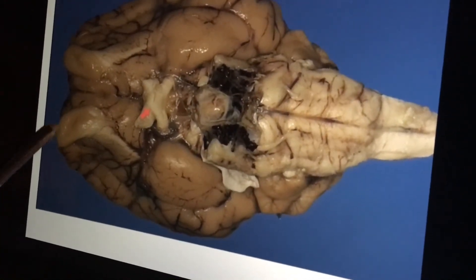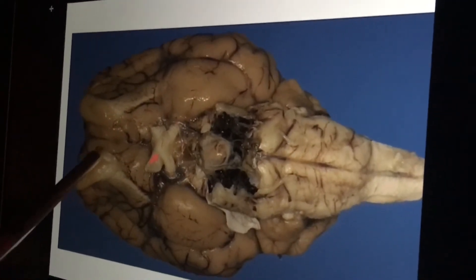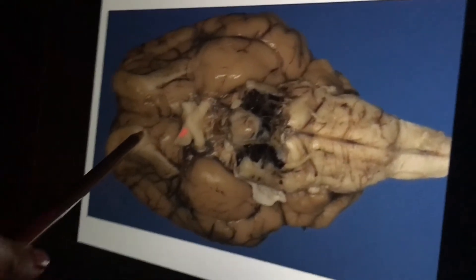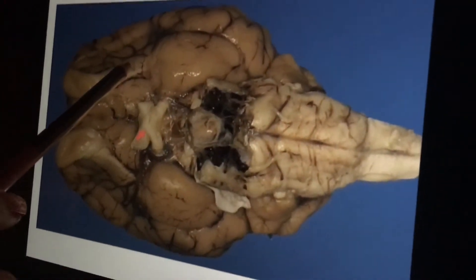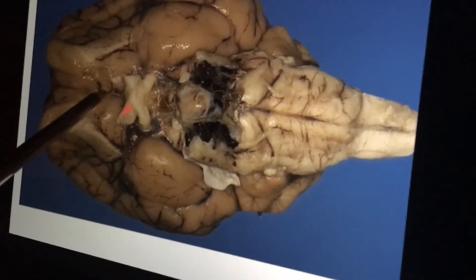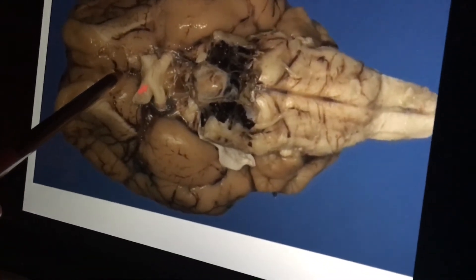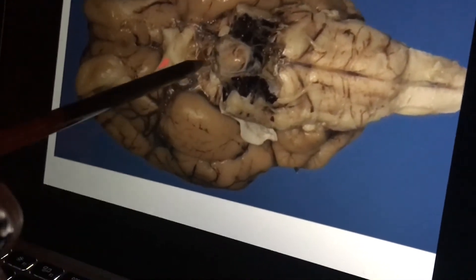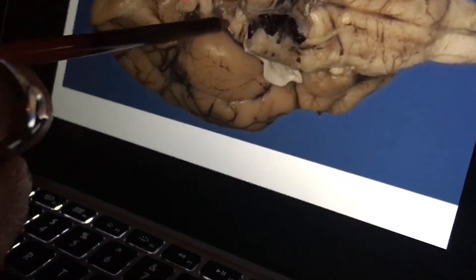Here are the olfactory bulbs, olfactory tracts, the oculomotor nerve, and here is the cerebral peduncles. Here is the mammillary body in here.